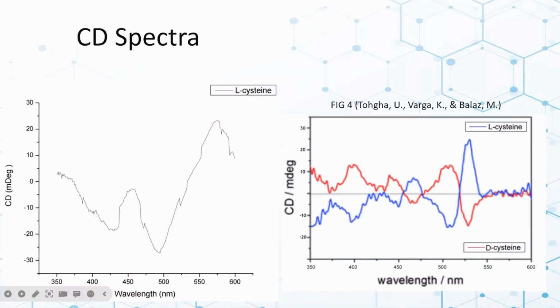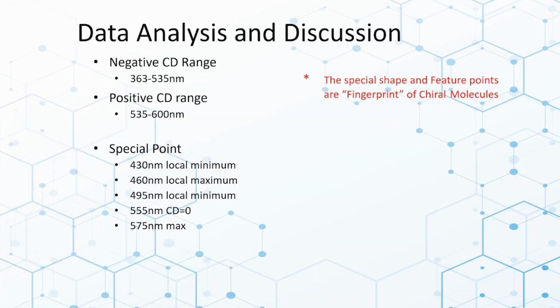Moreover, our plot agrees with the theoretical one to a great extent. The location and the size of some peaks differ. Between 350 and 400, our image is relatively smoother, while the theoretical one has 2 small local minimums. Otherwise, the shapes of the curves are largely the same for the other regions, and the error that caused this difference will be explained later. The spectral ranges and the spectral points we mentioned above are listed here.